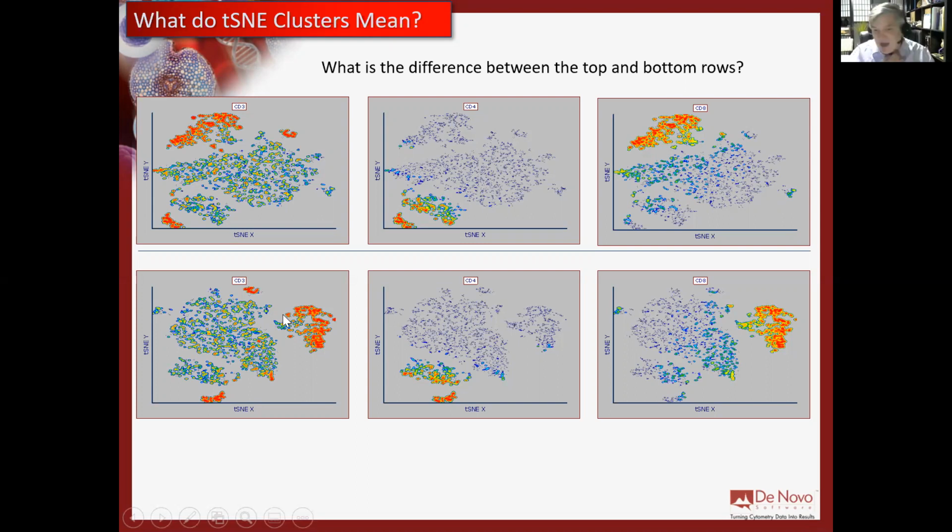So, because of that, one kind of pitfall that folks run into is they think, all right, well, because something on this plot is further away than something else on this plot, that they're very different. Right. And that's not true, because something has a global kind of distribution on this plot that's separated from another cluster on this plot.